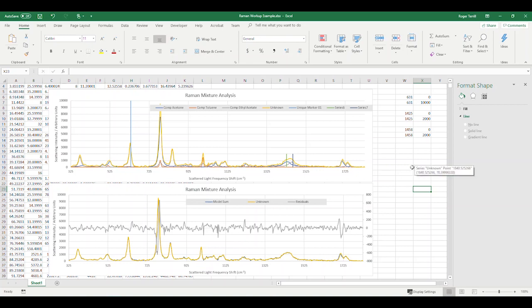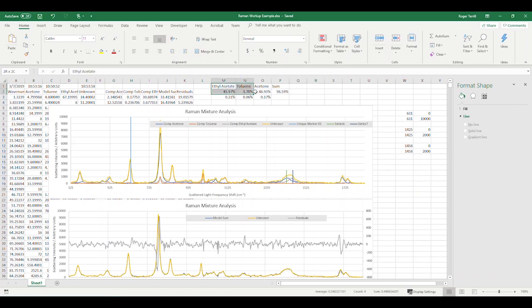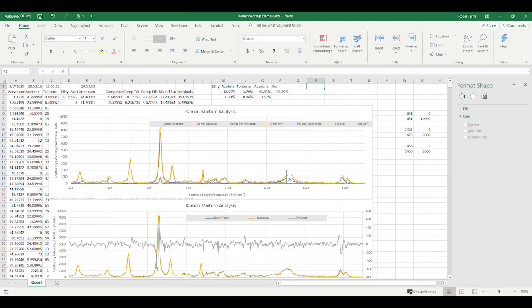Alright, so I found some peaks, you guys can probably do better than me on this, so that is all we really need to do with this mixture, so excellent work so far, then you want to answer the questions in the report, and then turn in the questions and this spreadsheet together, and have this table in the Word document that you make the mini report on. Alright guys, thanks so much.